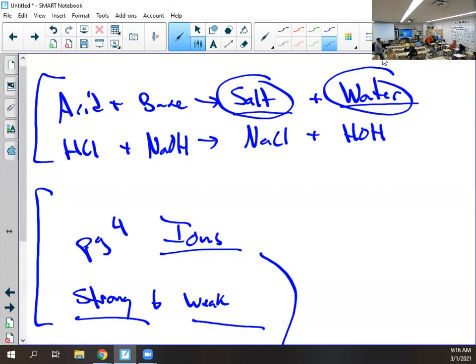If you don't remember whether it's an acid or base, look which data side it matches the most. And then really you're ready to go. You can dump everything in the sink.